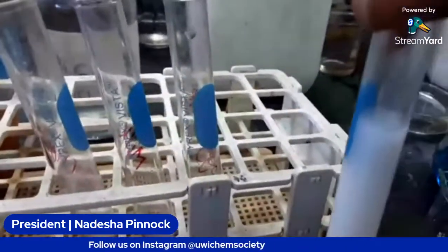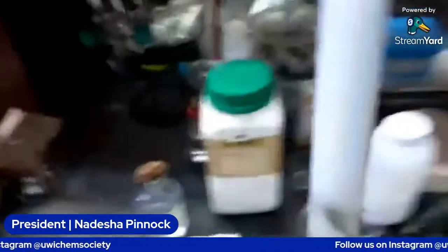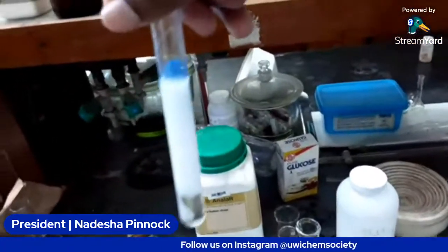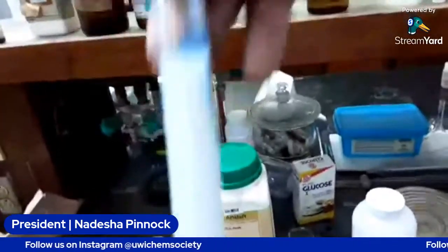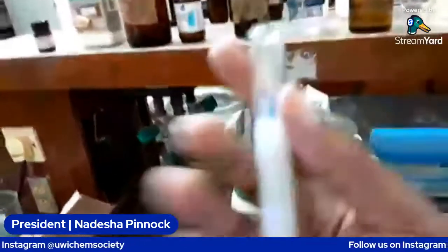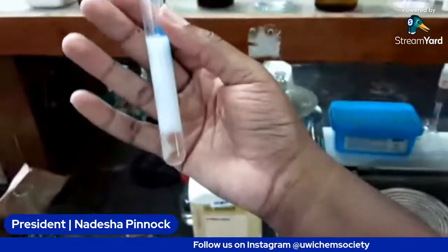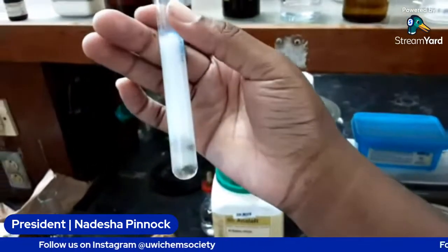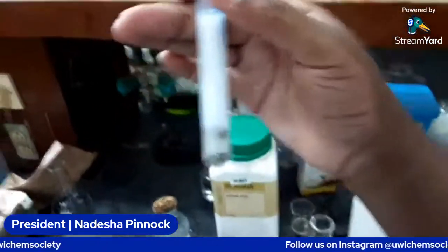And as you can see, you're going to see this milky white suspension. So it wasn't this milky white before. See that? Let me hold it here for you guys to see. There we go. So this is the milky white suspension that we're talking about.